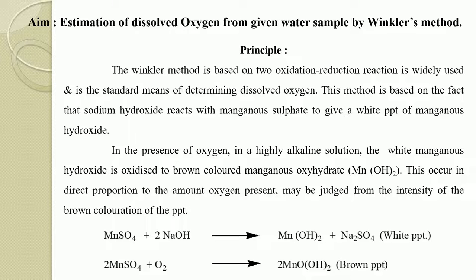by Winkler's method. Now as you know, oxygen is present in the atmosphere in gaseous form, but in aquatic water bodies, whatever water is present also contains oxygen, but that oxygen is in dissolved form.